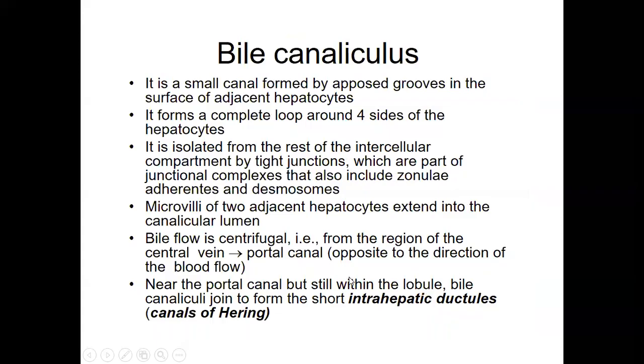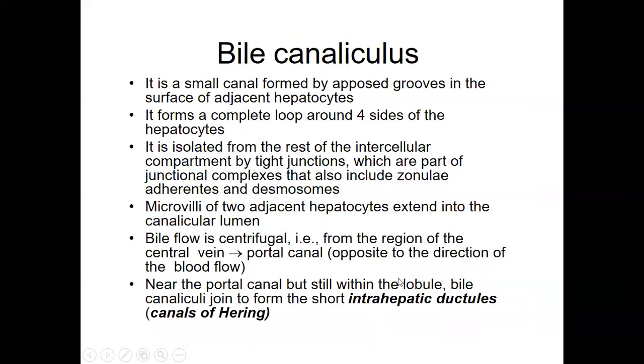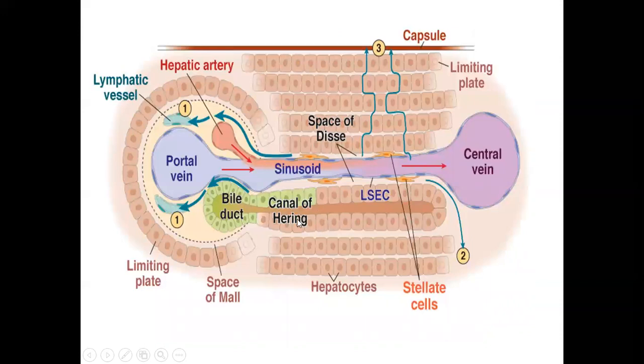Bile canaliculi join to form the short intrahepatic ductules, or canals of Hering. So you can see here, the short canal of Hering.